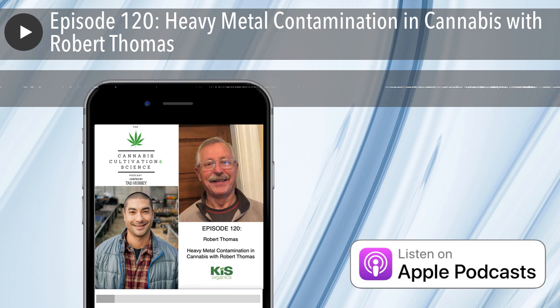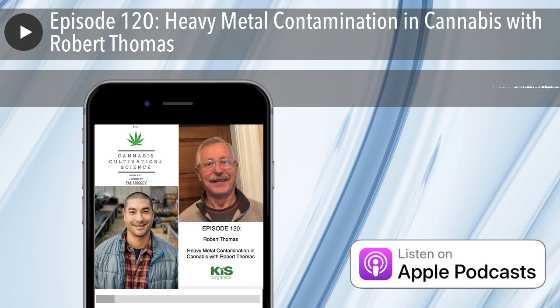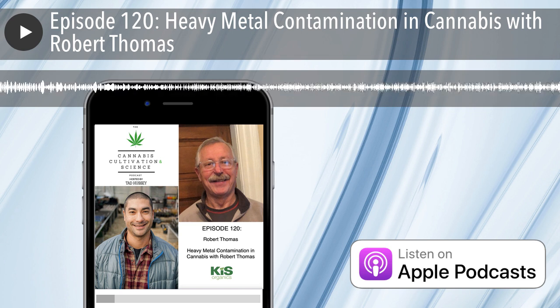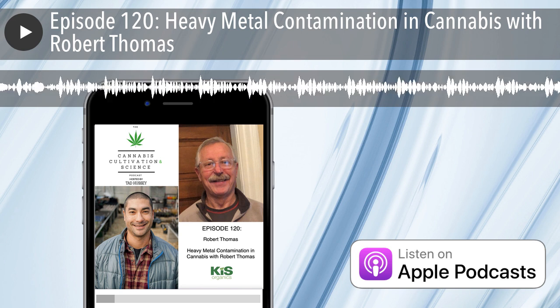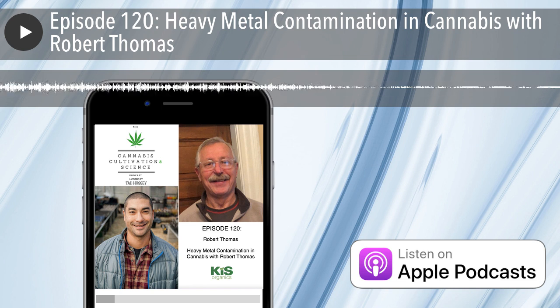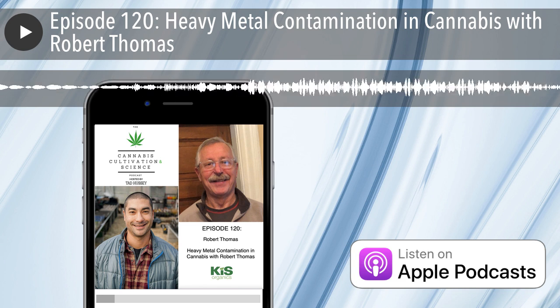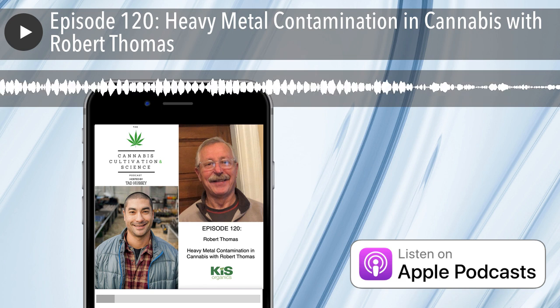Obviously, when you're using a very sensitive technique, many industries have to use specialized equipment. You have to use specialized acids, which are very clean acids, or you might have to dress up in what are called bunny suits, so the analyst is not actually contaminating the sample. That's quite common in the semiconductor industry. But also, when you're preparing the sample, when you're diluting the sample, you've got to make sure that your acids are clean. You've got to make sure that you're using the cleanest ultra pure, deionized water. And then you have to make sure that the instrument itself has positive extraction over it, and there's nothing that can actually drop down into where the sample is going.